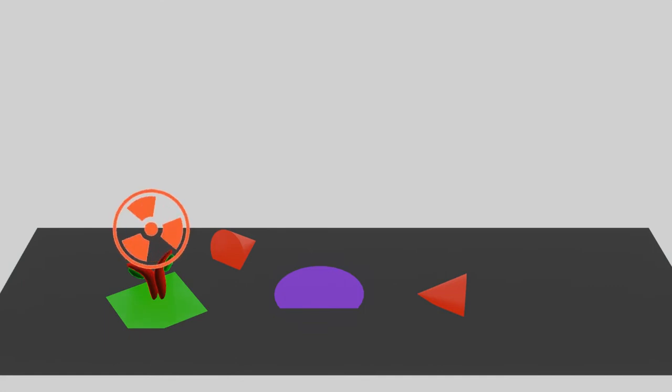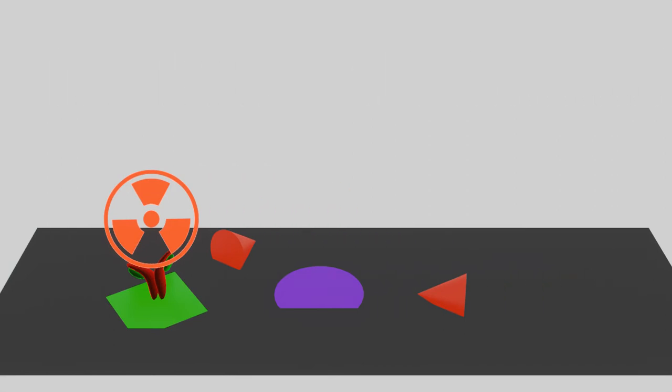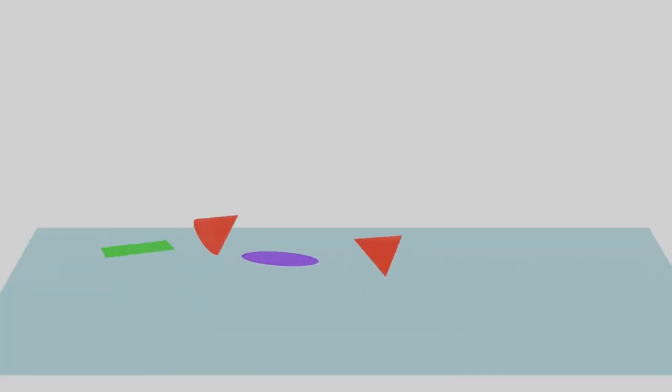If you used a radioactive label, it is called Radioimmunoassay, but the rest of the procedure remains the same. You can even use a fluorophore. The simple procedure we discussed so far is known as direct ELISA. There is scope for improvement here.